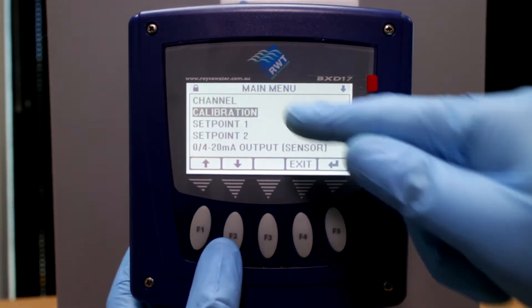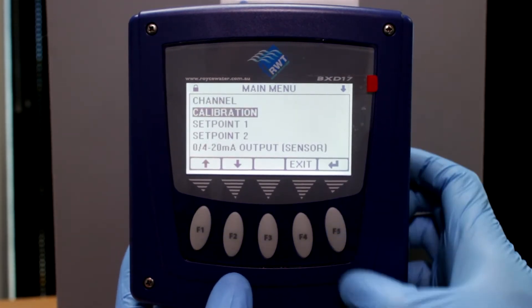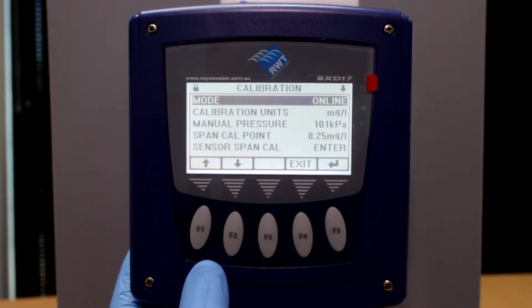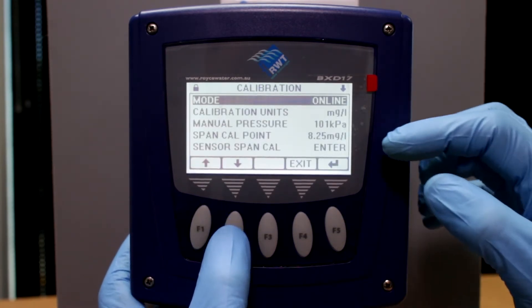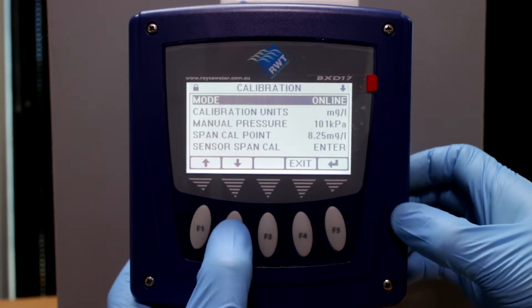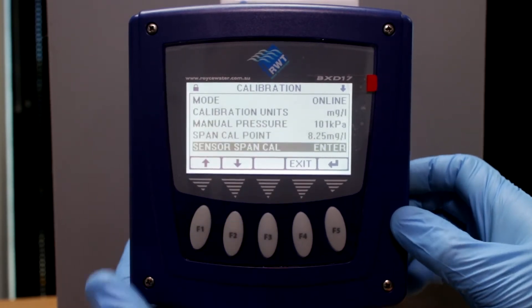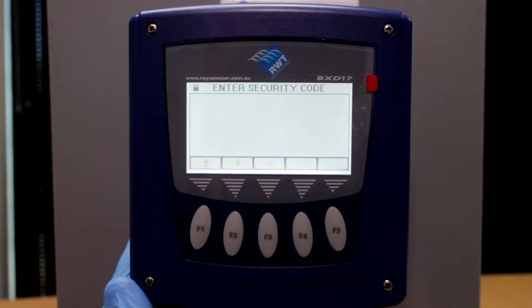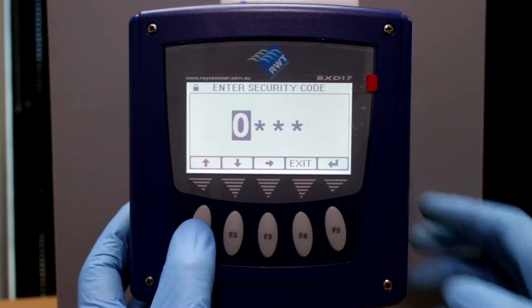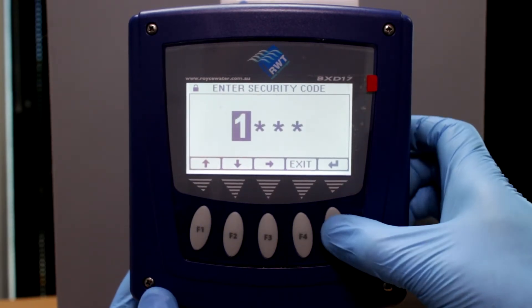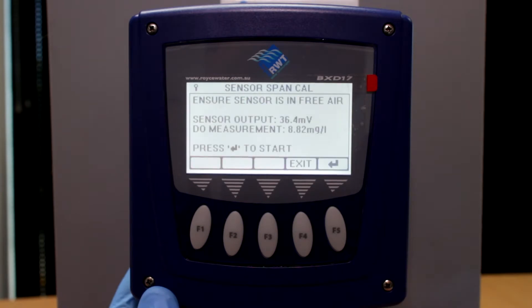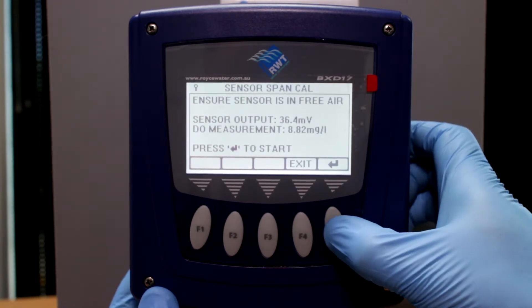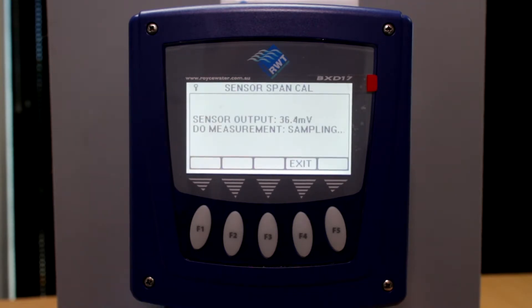F2 will bring you down to calibration, F5 for enter. You'll notice there's a sensor span calibration. F2 will bring you down to sensor span calibration, push enter which is F5. Your security code is 1 and push enter, and enter again. This is now taking a sample signal from your new probe. Calibration will soon be complete.